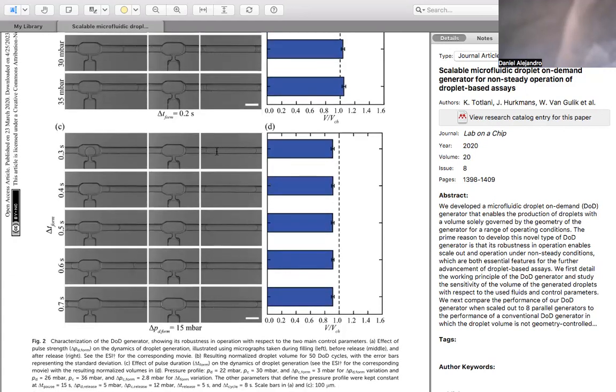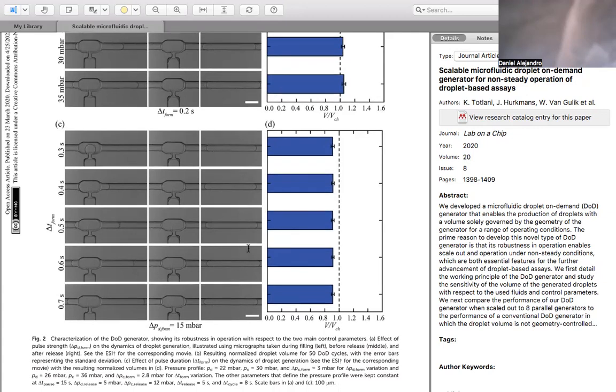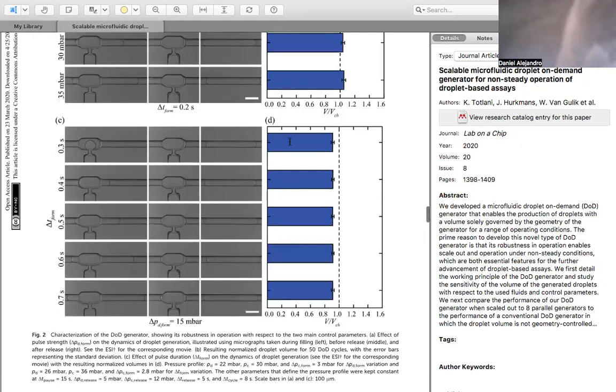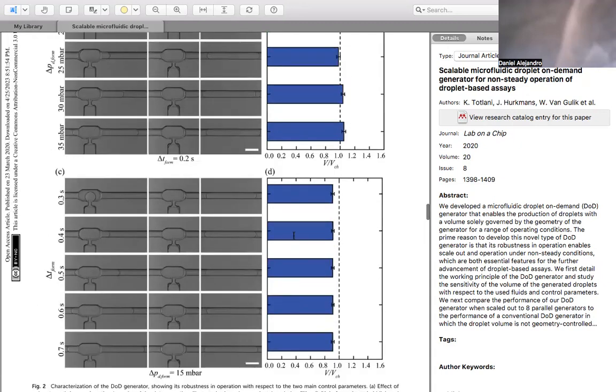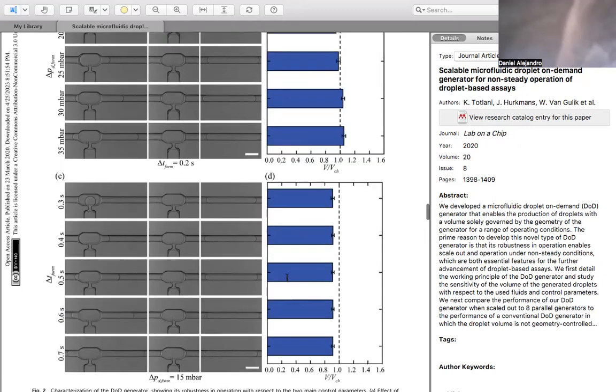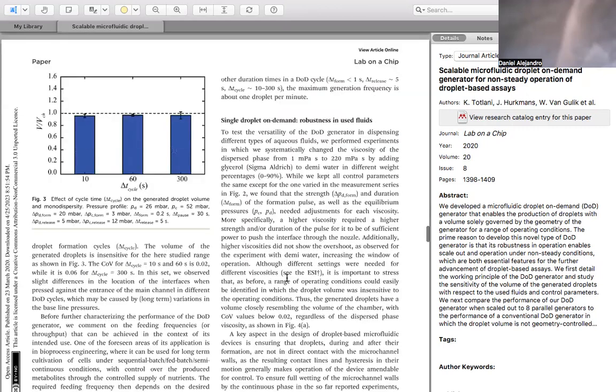They measured the droplets obtained in this microtube that is near the chamber, and found that basically all the droplets had the same size.